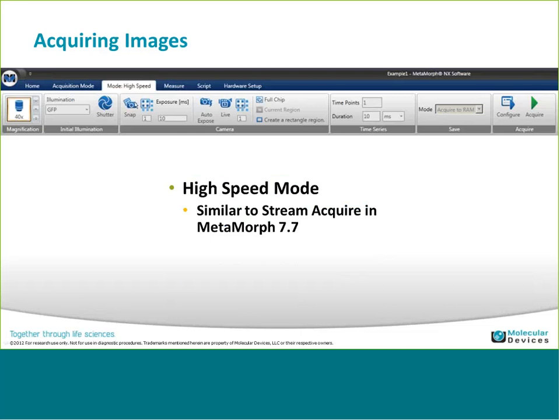So the channel series, you can specify the number of channels you want to acquire, and then the illumination settings associated with that. The calibration is a kind of a wizard, so it's a step sequence of things that you would have to configure, and also to be able to set up the calibration to knowing the positions of the laser as it moves in reference to the field of view to your camera, so it will know where to move. So it also helps you with the orientation of the camera.